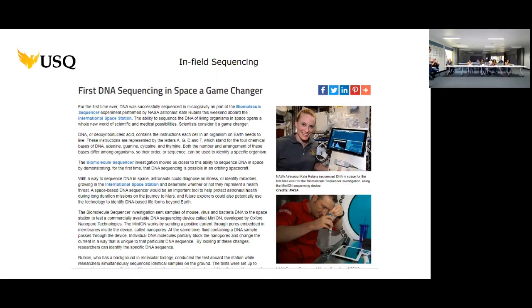You might need to forego quality checks, forego some purification or short read eliminators. You're not potentially going to do that in the field. If you want to get a quick answer, generate just a small amount of data, sure. So they're the kinds of things you might need to work on if you want to consider doing this in the field.